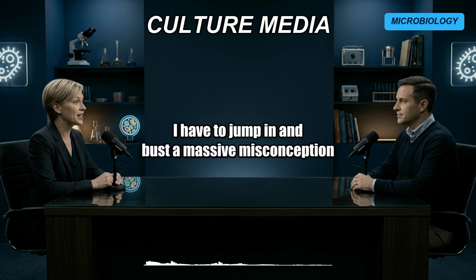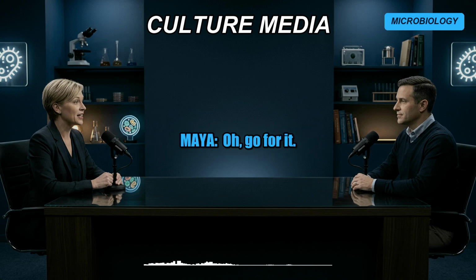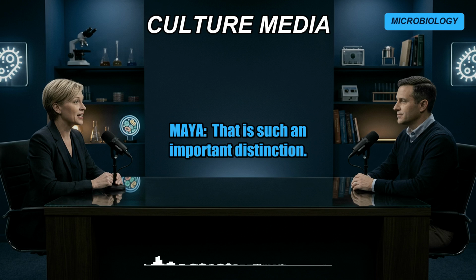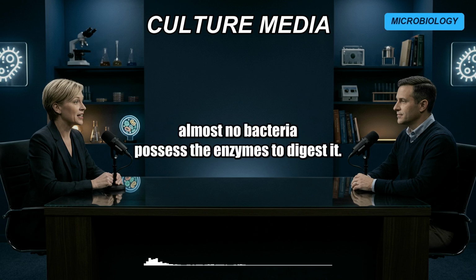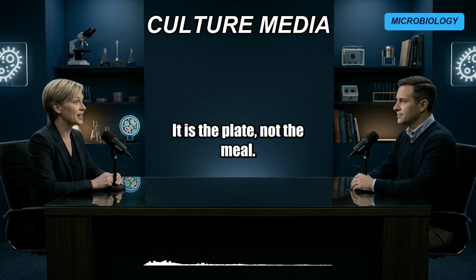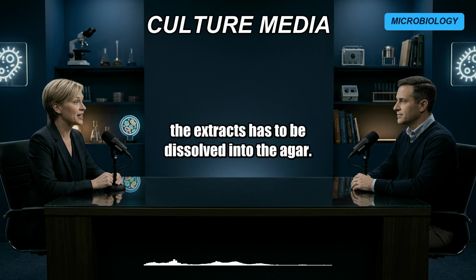Okay, I have to jump in and bust a massive misconception here because it trips up so many people learning about this. Oh, go for it. Agar itself is not the food. It contributes zero nutritional value to the microbes. That is such an important distinction. Right. Almost no bacteria possess the enzymes to digest it. It is purely the structural gelling agent. It is the plate, not the meal. All the actual food, the broth, the blood, the extracts, has to be dissolved into the agar.